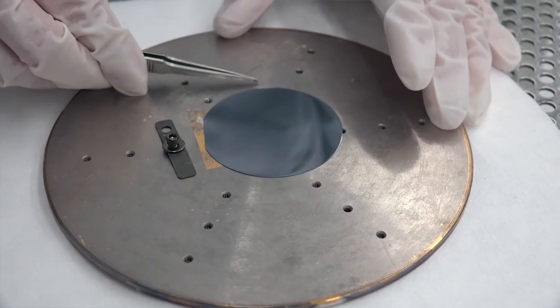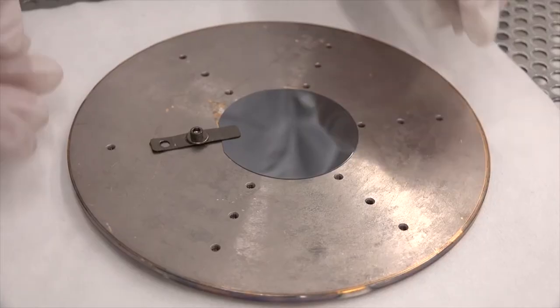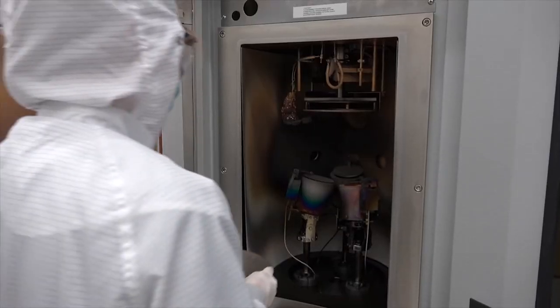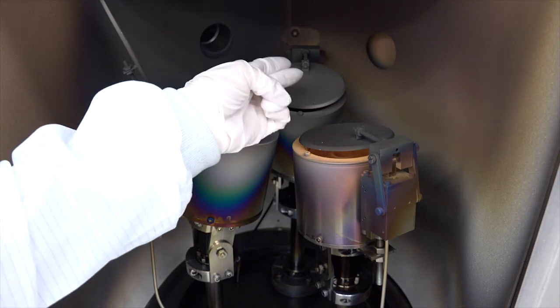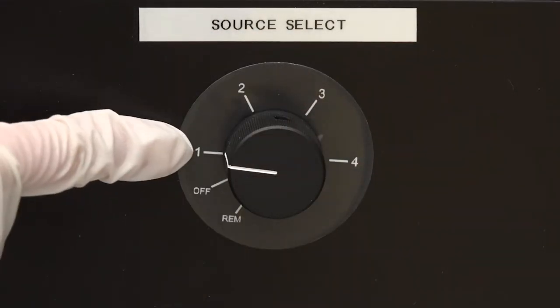We place our substrate on the metal plate and hold it down with a small spring. Then we return the metal plate to the chamber with our sample attached. Let's double check that our desired source material target is in the chamber and note the location. 1, 2, or 3. In this case, titanium is in position 1. We set the control knob on the sputter system to target number 1.